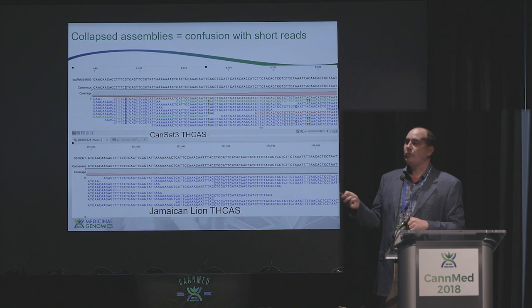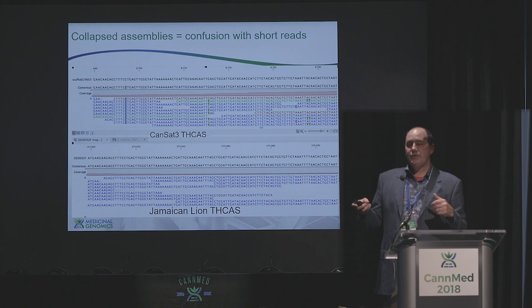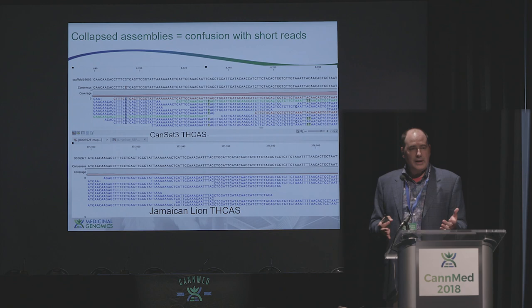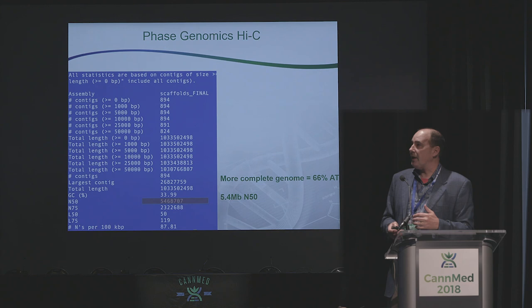But even with these blue ones, you can see paired reads, there are four SNPs in here that probably don't really exist. And when you map these same reads to Jamaican Lion, you see that those reads then map to those other genes that we just found that are tandem. And so it cleans up a lot of your mapping, it cleans up a lot of your polymorphism discovery, and now we have a reference where we can maybe go ahead and make a SNP chip out of this and not be confusing all the signals that we might get out of the chip.